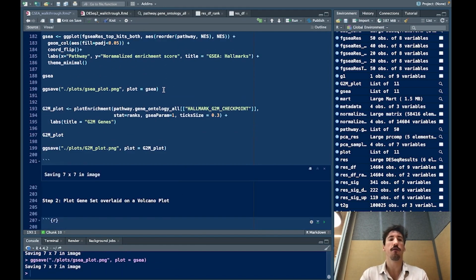And these will just save a nice PNG image into the folder that you're currently working, and you can input these into your publication or PowerPoint slides or emails, however you want to share your data. But ultimately, these are publication-ready plots, and I just do a little bit of tweaking in Illustrator or PowerPoint to actually create them as a final product.